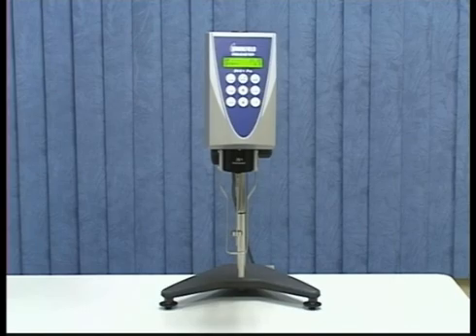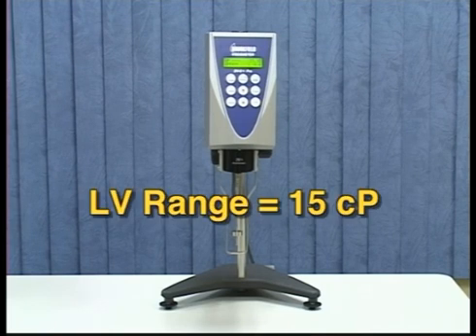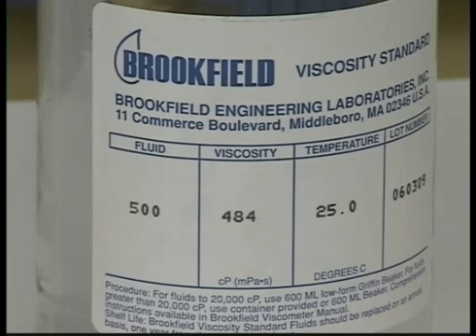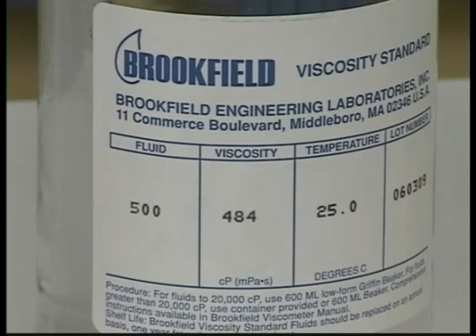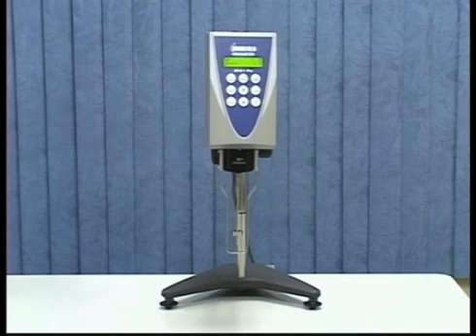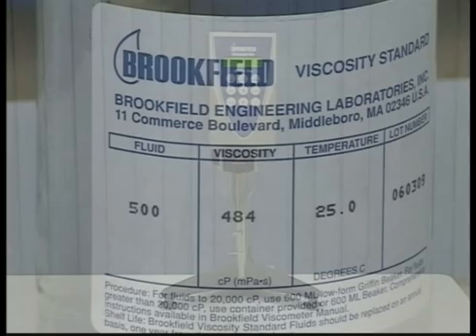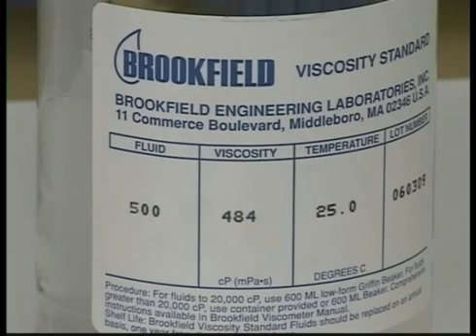Select a viscosity standard fluid based on the torque range of your instrument. For example, an LV torque instrument has a minimum viscosity range of 15 centipoise, so a 500 CPS fluid will be fine. For this calibration example, we will use an LV DV2 Plus Pro viscometer and a 500 centipoise viscosity standard fluid.